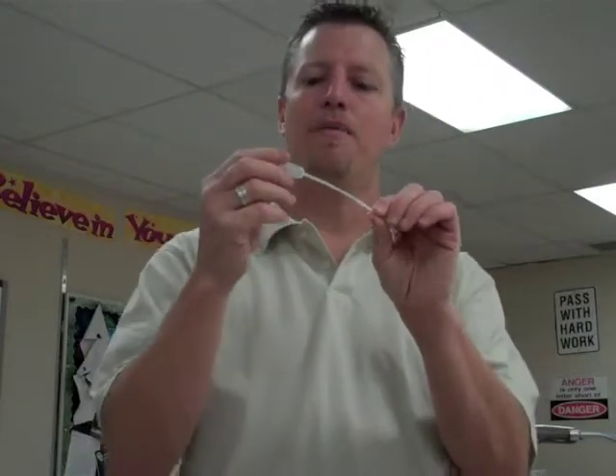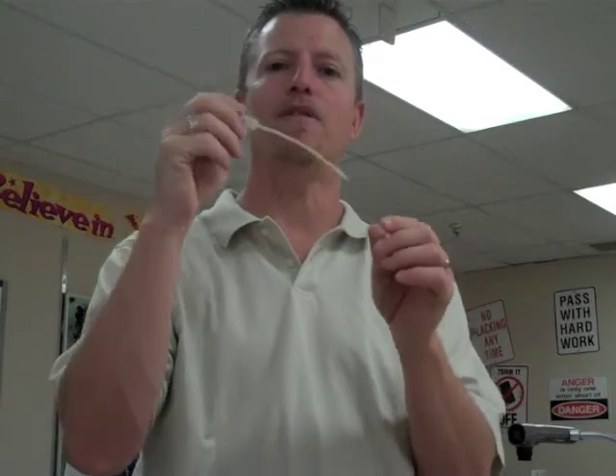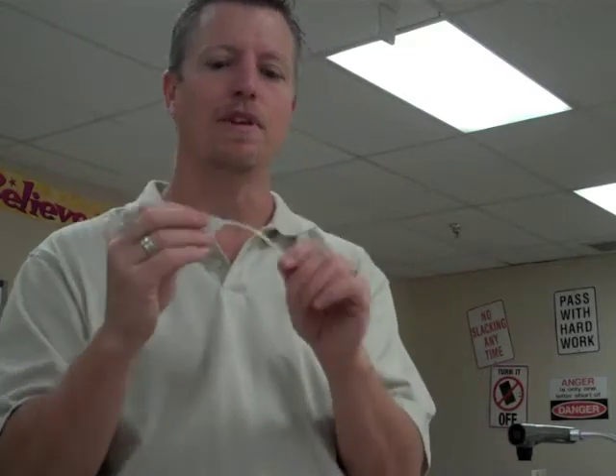This is a pipette. A pipette simply allows you to squeeze up a certain amount of volume of liquid and move it into another container. These aren't as accurate as the ones used in professional labs these days, but they're okay for lab settings, and we use these for different types of chemical labs.